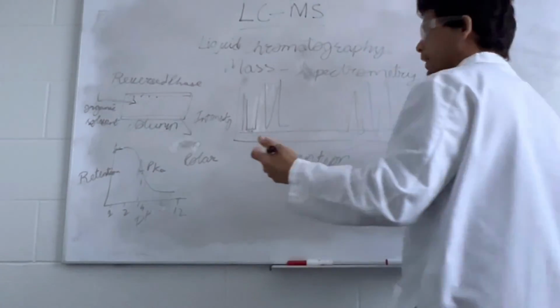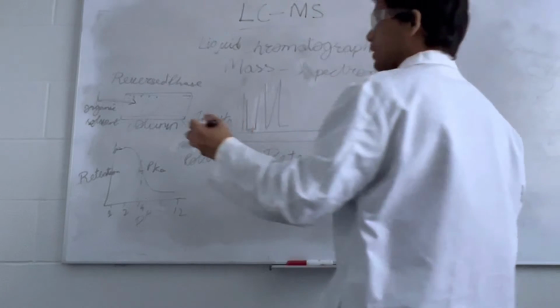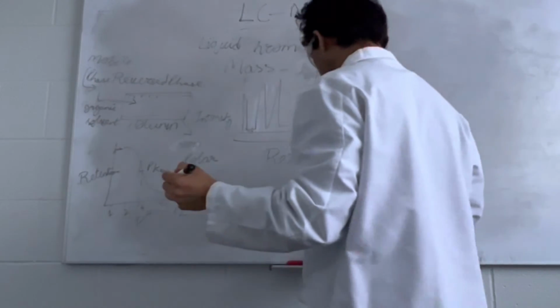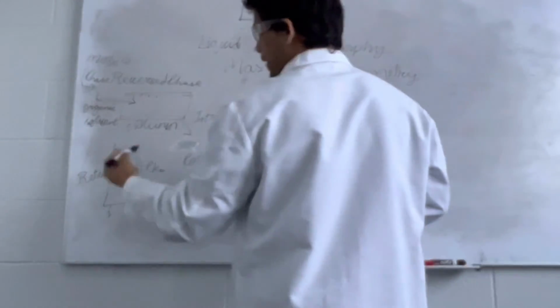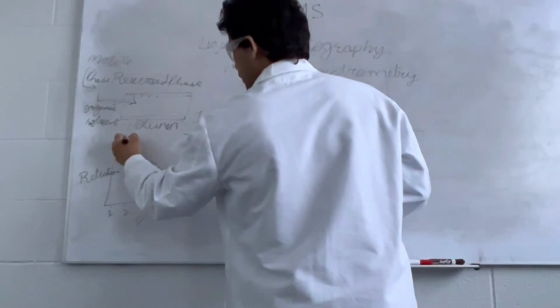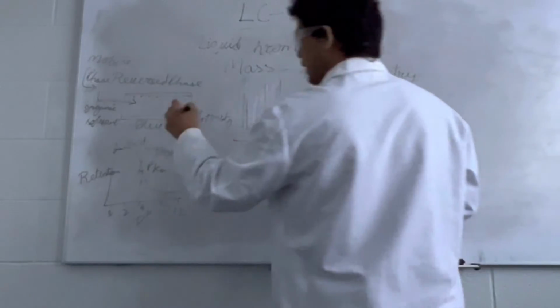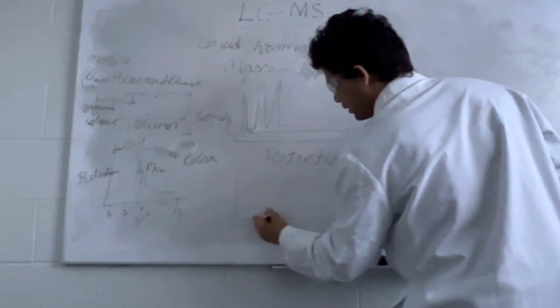The general rule of thumb is that the pH of the mobile phase should be plus or minus 2 of the pKa value of the sample. This I have shown for the acidic components in the sample, and for the basic components it is completely reversed.